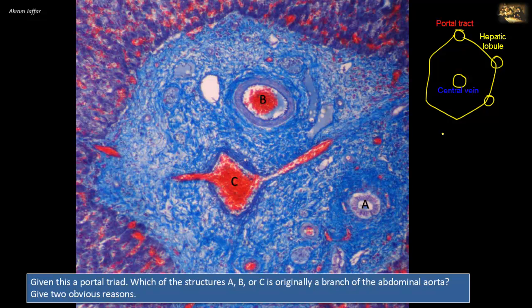The circular profile A is lined by simple cuboidal epithelium, so it is not a vessel but a bile duct. B and C are vascular profiles, since they are lined by endothelium, which is a simple squamous epithelium.